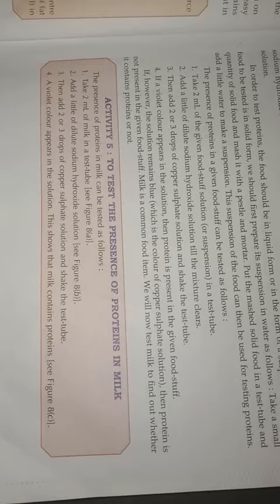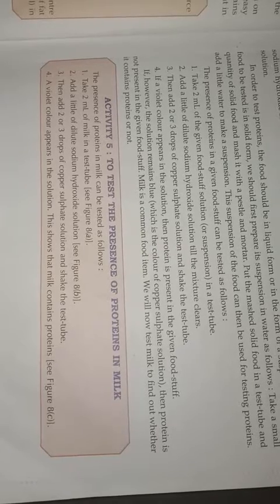Add a little dilute sodium hydroxide solution. Then add 2 to 3 drops of copper sulfate solution in that test tube. Shake the test tube. A violet color appears in the solution. What happened? Milk contains protein. That's why the copper sulfate, which is blue in color, changes into violet color. That means the given milk contains protein in it. Understood? This is how we test the presence of protein in our food.